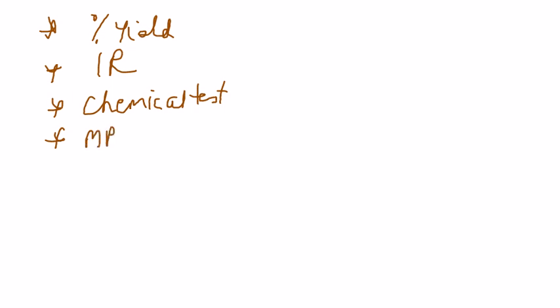And it's a comparison of the melting point of the starting material and the product, which is going to give us the difference. First thing about the melting point, if you think that as you're heating, irrespective of the temperature, the color is changing, that will basically mean that it's going to go through a decomposition process, and sugars in general do so. So record that. Record what you see. If you see a change in color, record that.